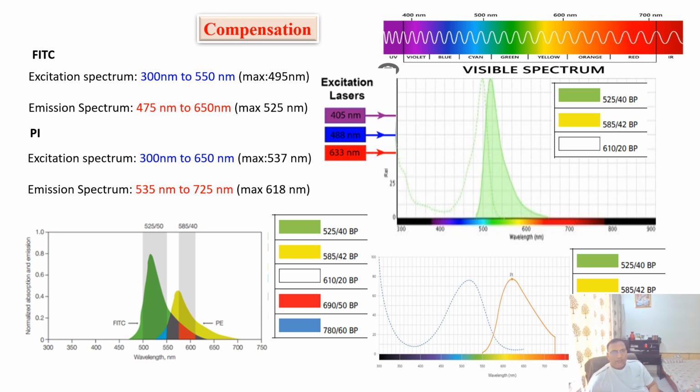So this 585 plus or minus 42 can also detect FITC. Think, listen carefully. How is it possible?